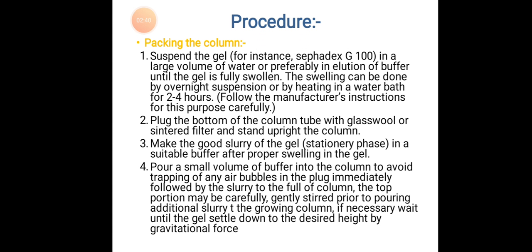Procedure: packing the column. Suspend the gel, for instance Sephadex G, in a large volume of water or preferably in elution buffer until the gel is fully swollen. The swelling can be done by overnight suspension or by heating in a water bath for 2 to 4 hours. Follow the manufacturer's instructions for this purpose carefully. Plug the bottom of the column with glass wool or a sintered filter and stand the column upright. Make a good slurry of the gel stationary phase in a suitable buffer after proper swelling of the gel.